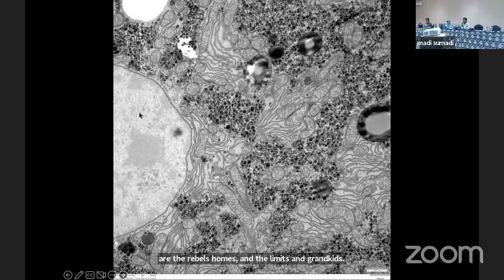So if you look at the nucleus, it tells you this is an active hepatocyte. This one is completely dark, it's inactive. You can also see the mitochondria, the typical tubular, very elongated mitochondria, which tells of steroid synthesis, the very tubular ones. Where no steroid synthesis occurs, you have the normal elongated mitochondria. You can see the cristae.